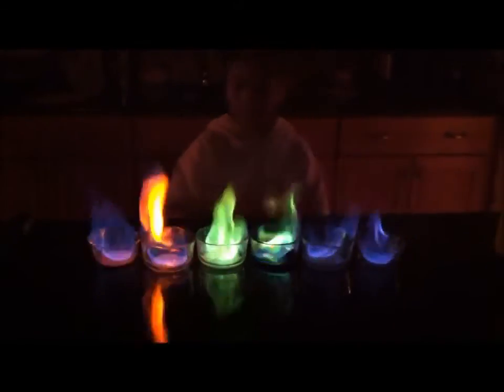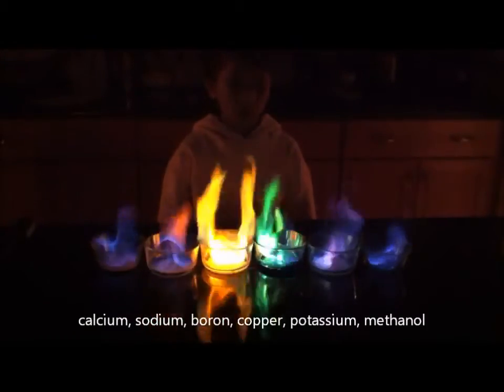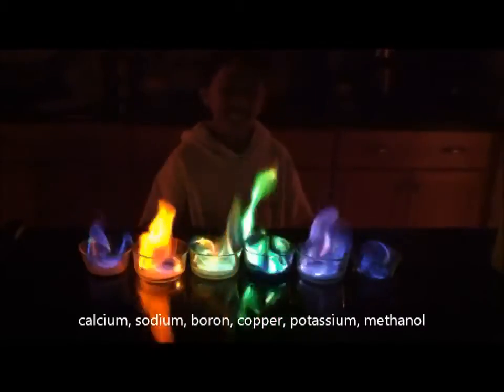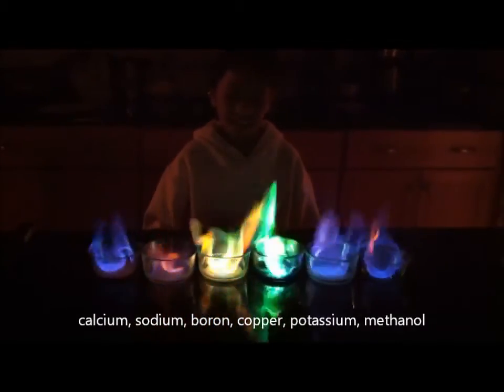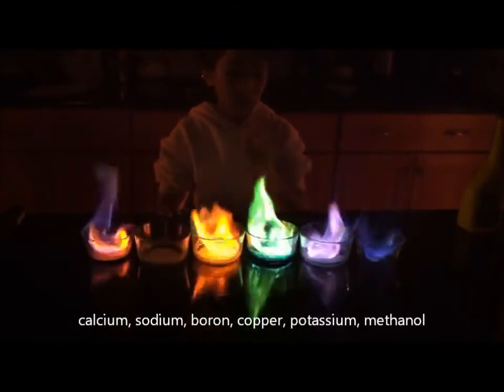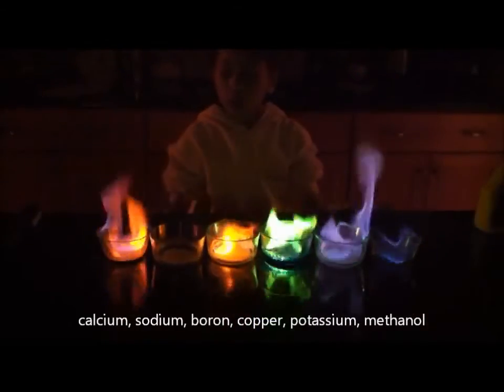There is some red. You can sort of see the purple — there is pink and purple. The calcium is red, you can see it. It looks red through the screen. It looks red on the far left.